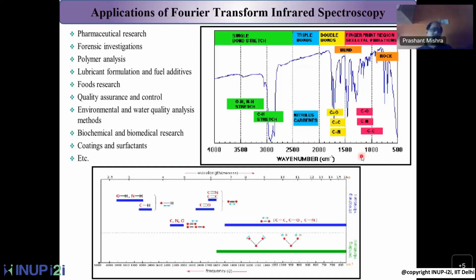spectra, which are basically either transmittance, or you can put it in the absorbance mode, where you can find out that at a specific wave number you get this transmittance value. This can also be illustrated depending on the frequency. You can find OH, NH, then CH, OH. So that way you can find the frequency where this kind of absorbance is occurring, and that is stretching vibration, bending vibration, etc., which is responsible for such a spectrum.